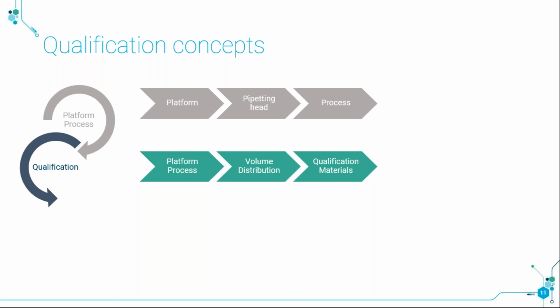liquid class, etc. The idea here is for the operator, for the scientist, to transpose everything he's doing on the bench into the application. So the concept we call qualification in the application is actually meant to represent your experimental protocol.